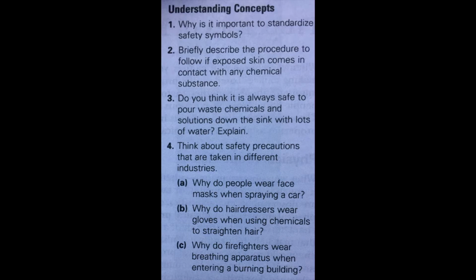Do you think it is always safe to pour waste chemicals and solutions down the sink with lots of water? Explain. No, you only dispose of chemicals according to the instructions for those chemicals that are given in the pre-lab instructions. Listen carefully to all procedures. Think about safety precautions that are taken in different industries.